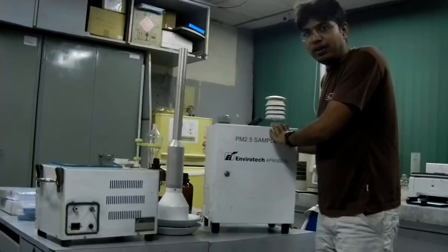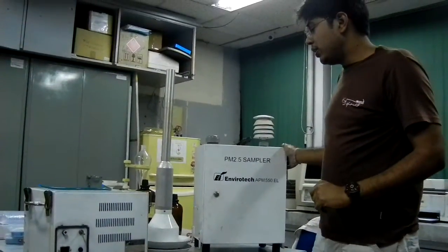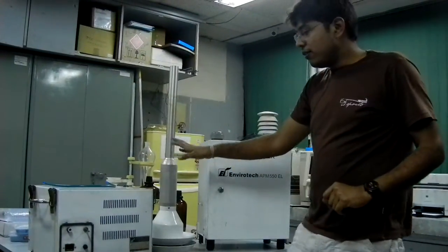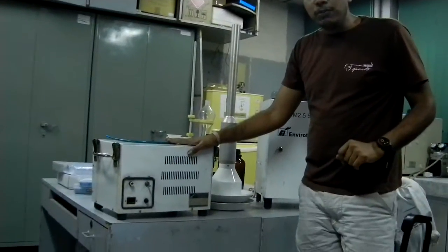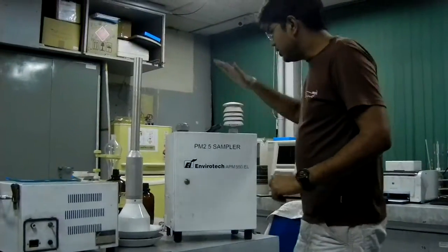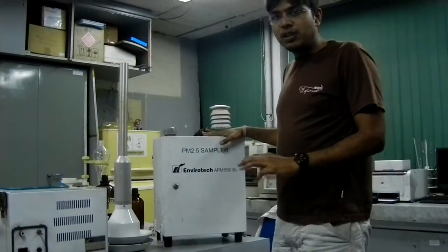This is a PM2.5 Sampler, model Envirotech APM550 EL. It has three components: the first one is an oil-less pump — it's a noiseless pump; the second one is the inlet probe; and this is the control module. We will first discuss the connections.